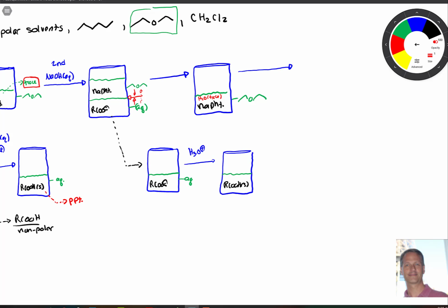So we could get the naphthalene out of solution if we just evaporated the ether, but with trace water, you'll evaporate the ether and then you'll be left with water. That's not the end of the world. It just takes time, right, to evaporate water. Ether evaporates very, very quickly. So what we do is we first dry our ether layer with sodium sulfate. So sodium sulfate wants to form a compound called sodium sulfate decahydrate.